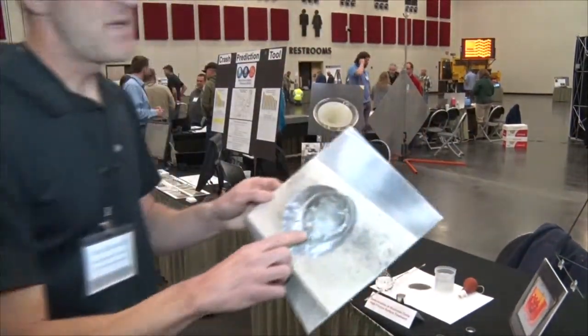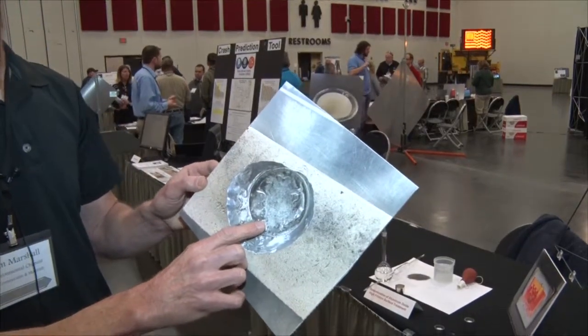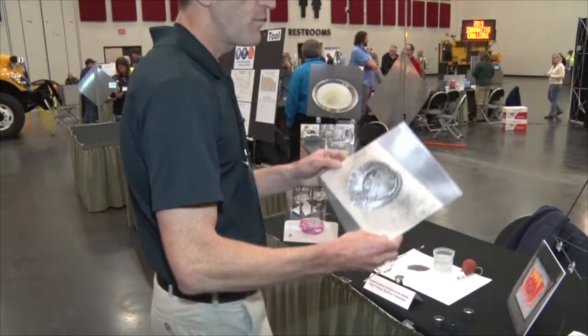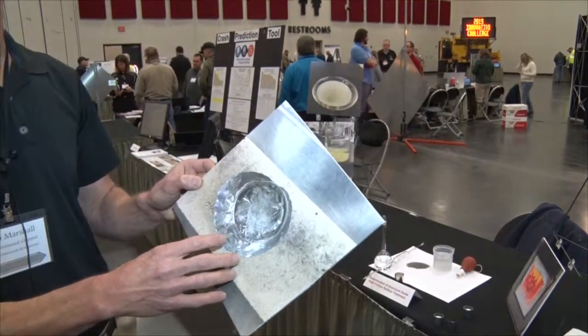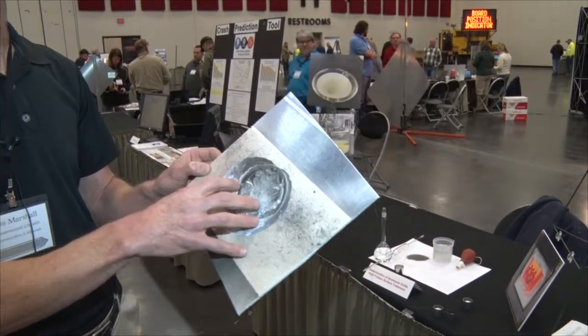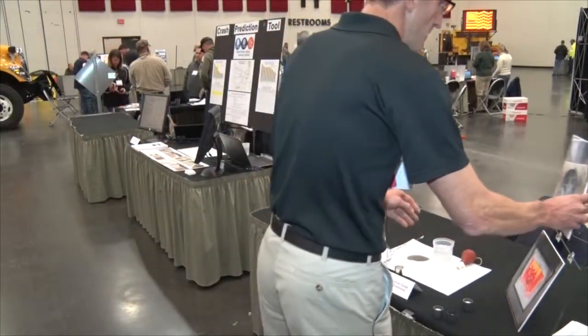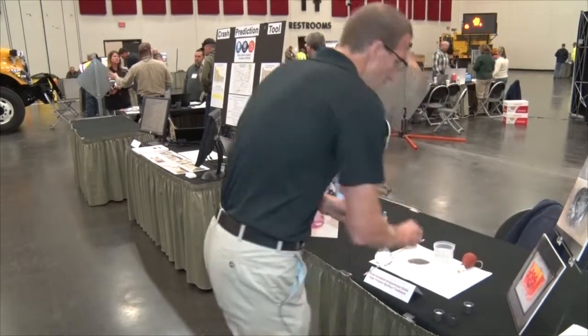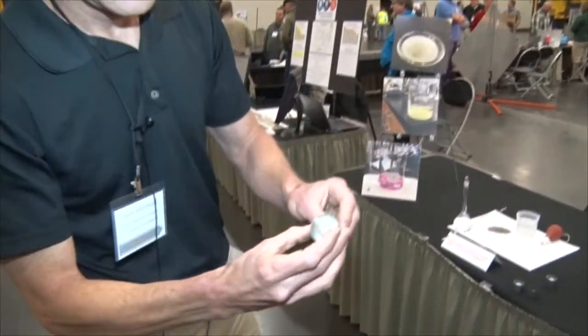From there, it becomes an oxide, essentially. The hydroxide burns off, it becomes an oxide. So what we have here is a combination of aluminum, iron, silica, phosphorus, and titanium. And this is what it looks like after.